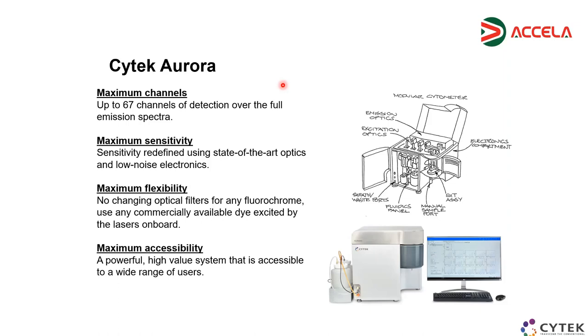It's quite low, and even lower with autosampler, which comes with this sample recovery option that is putting back the unutilized sample. Thank you so much.